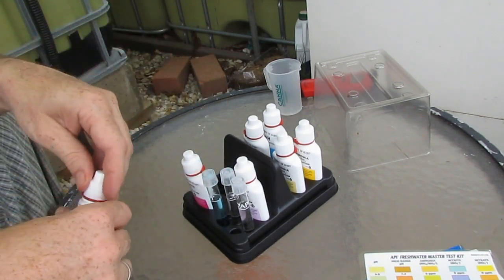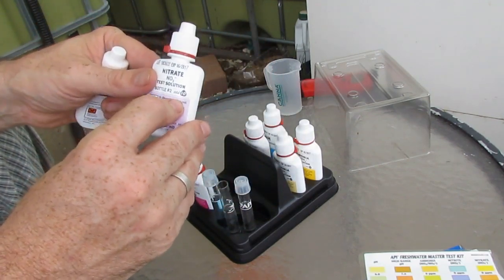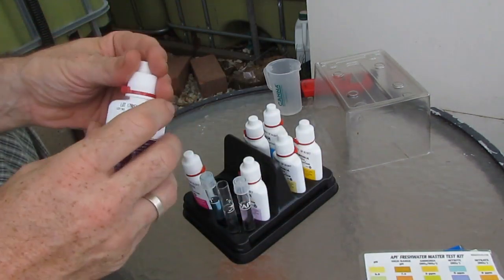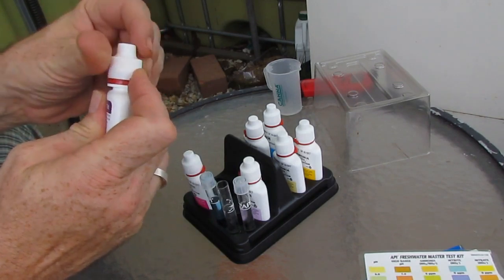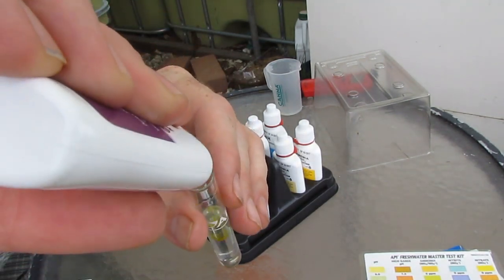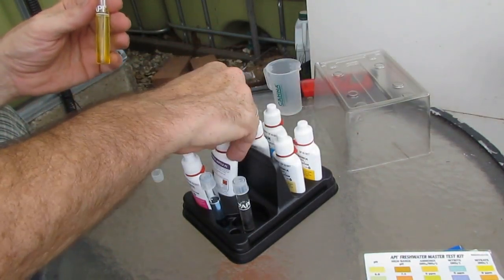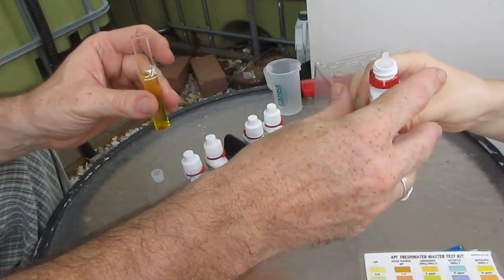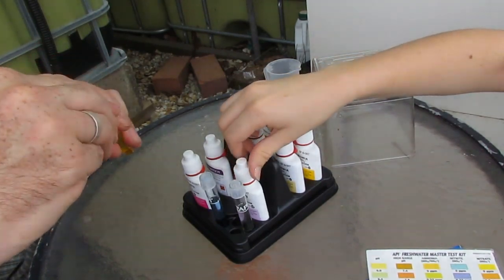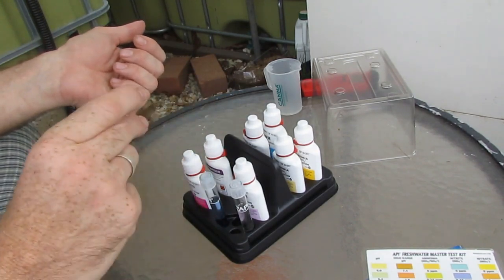Then we do the nitrate. The nitrate is a little bit different — not only is it a 2-bottle system, but with the second bottle it's recommended that you shake it for 30 seconds before adding the drops. I've already given it a good shake so it should be right to go. It's got this handy tab that locks the bottle top on. This one we need to drop 10 drops of each, so that's 10 drops. Just give that a bit of a swirl around, and another 10 drops. Then we give this one a shake — this one gets shaken for about a minute and then left to rest for 5 minutes along with the rest.